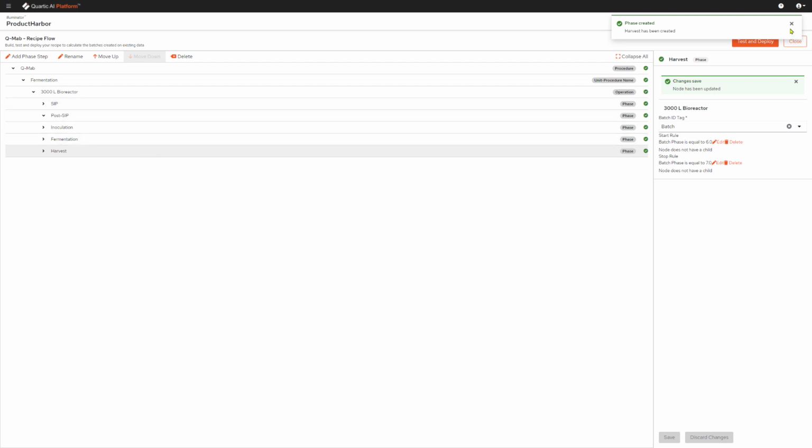All right, so I can add more operations to this, and I will go back and show you a completed one with this built out a bit more. But for now, I'll stop with this, and I want to go through and test and deploy this now. So this would be the next step. What I can do is run this against historical data, historical batches, and make sure that it's working as expected. So I'll go ahead and click test and deploy.